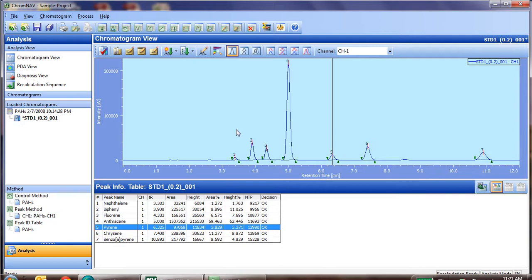Now, in addition to system suitability, statistical calculations are very easy in ChromeNav as well, such as getting relative standard deviations, means, averages, and modes. So let's learn how to do that.